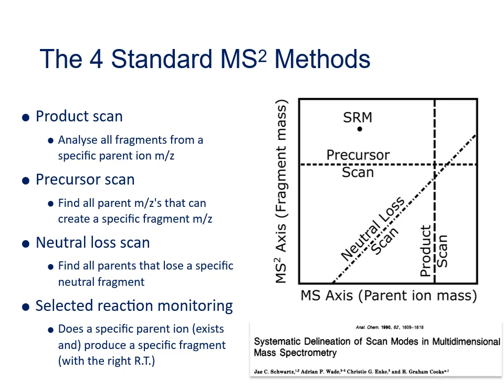And finally, in the selected reaction monitoring mode, you're asking the question, does a specific parent ion exist? And if it does, does it produce a specific fragment ion? And also with the right chromatographic retention time.